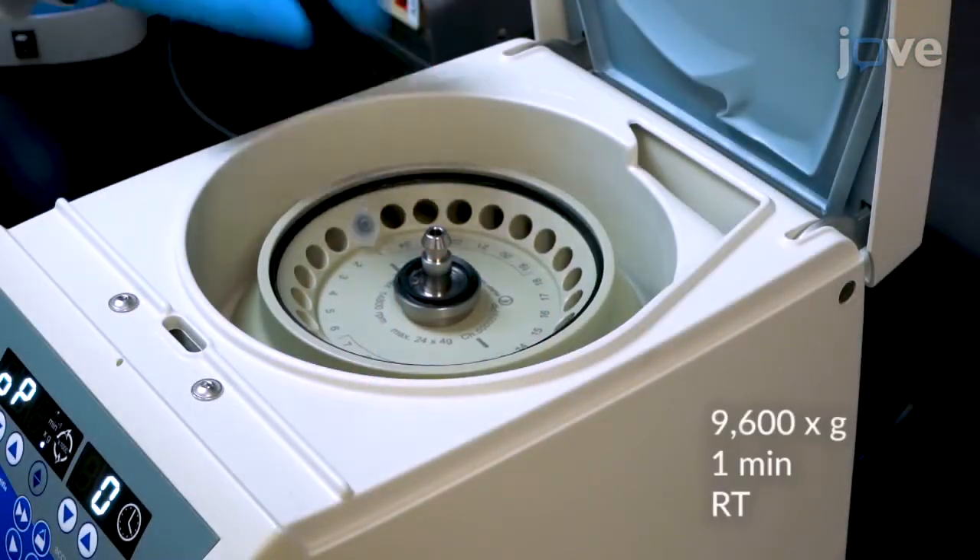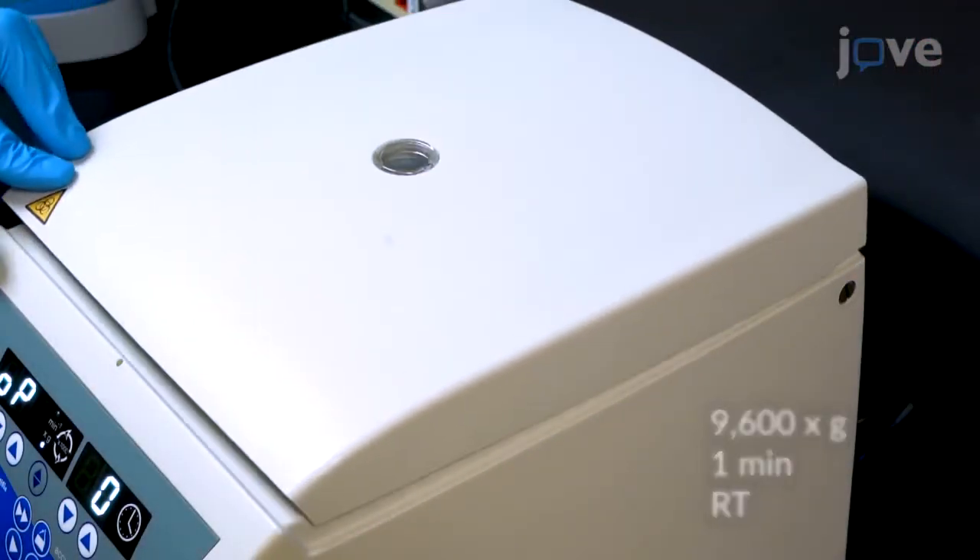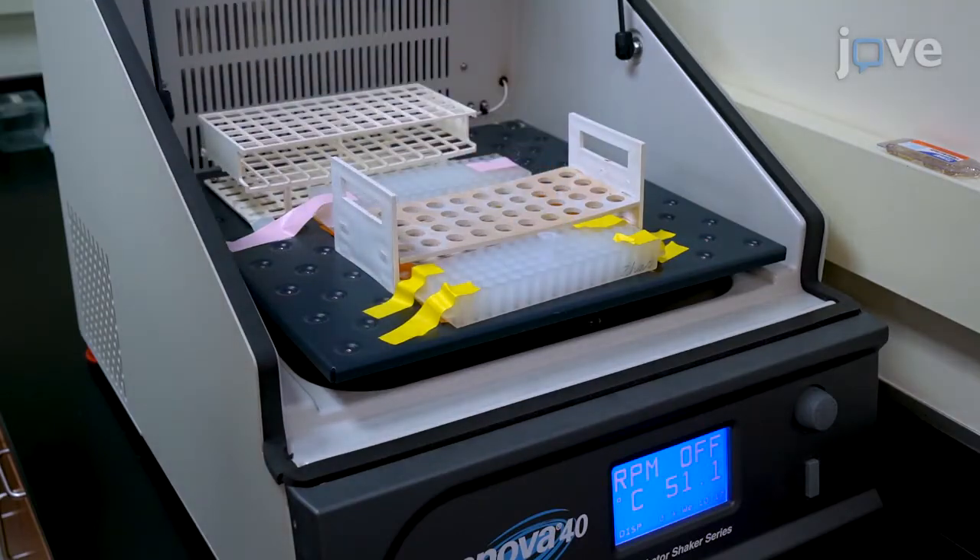After homogenization, centrifuge the tissue lysate and incubate for 2 to 3 hours at 56 degrees Celsius.